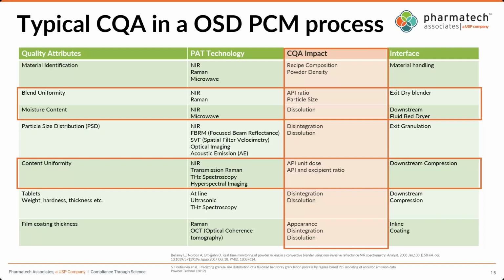Yeah. So, and this is all kind of NIR. As you highlighted already, it seems to me that NIR technology is the most advanced and insofar the most reliable when it comes to implementations. What would you say about this observation?